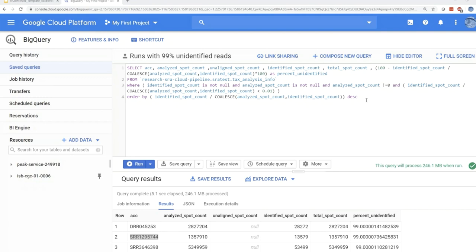Another question that's sort of a general one that's probably useful to address. It has to do with what data are publicly accessible, and I think it's probably worth talking about the difference between the controlled access data and the data that's not controlled access, and what one would have to do to get to those things.